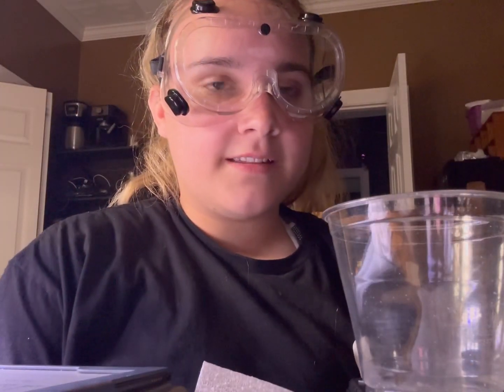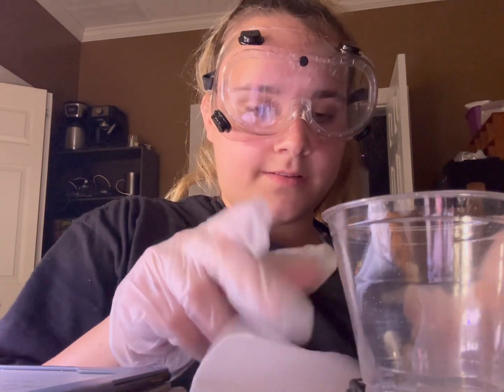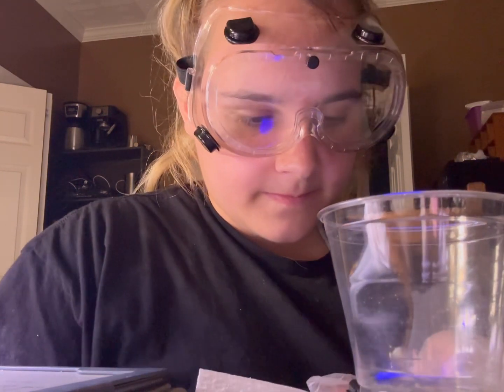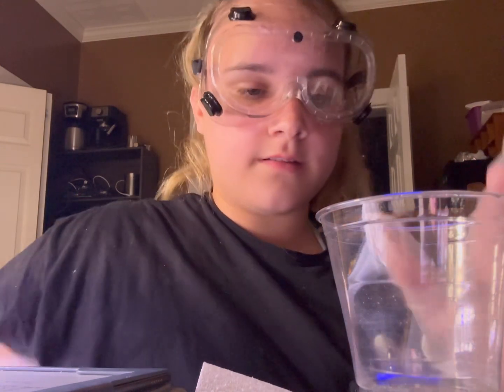Now we're moving on to the final part of lab 3. So we'll turn the scale on and we'll weigh another 100 grams of ice. Alright, so let's start adding the ice.